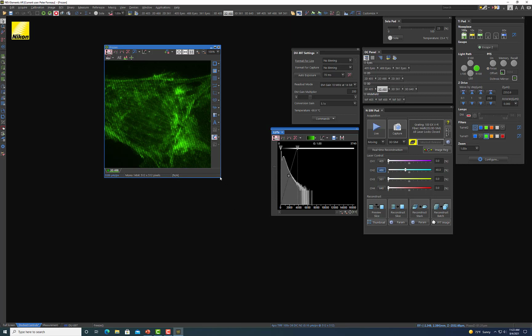On the biology end, you could also just work with your sample labeling to get them even better and brighter, because basically these lines are easier to see the brighter your sample is and the higher the signal to noise ratio is.